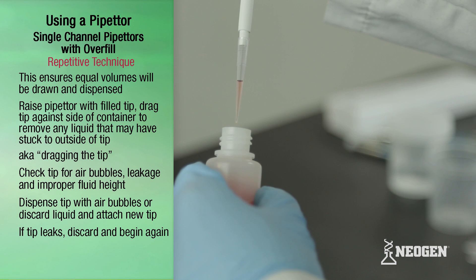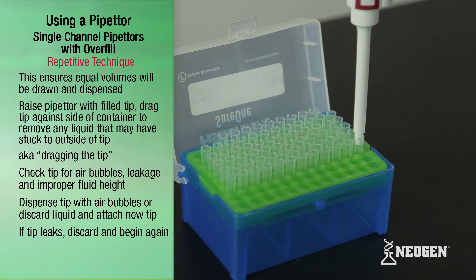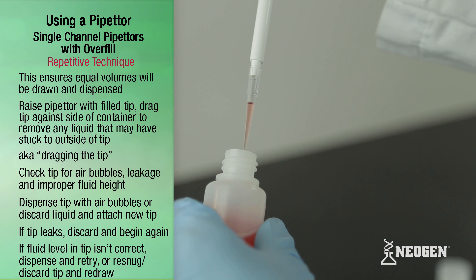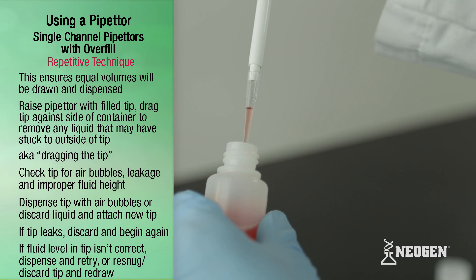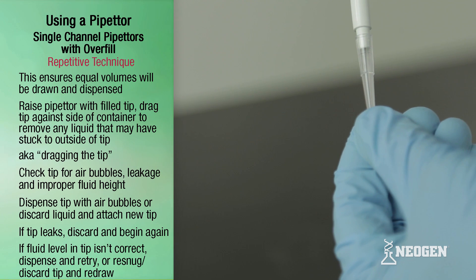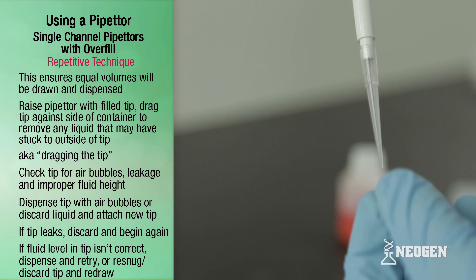If a tip is leaking, discard the tip, attach a new one, and begin again. If the liquid in the tip is not at the correct level, dispense the liquid back into the vessel, re-snug or discard the tip, attach a new one, and redraw.